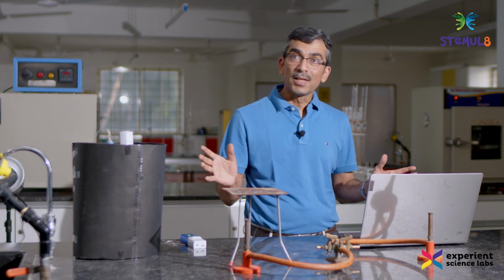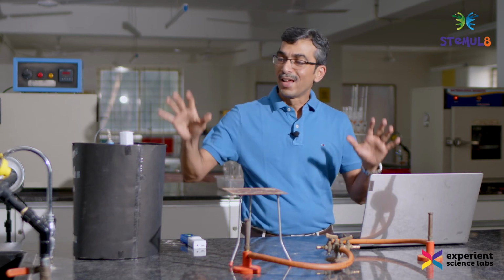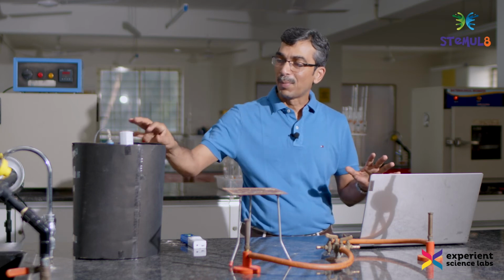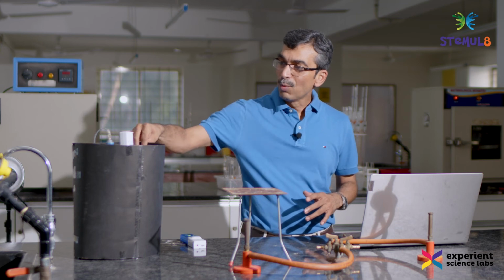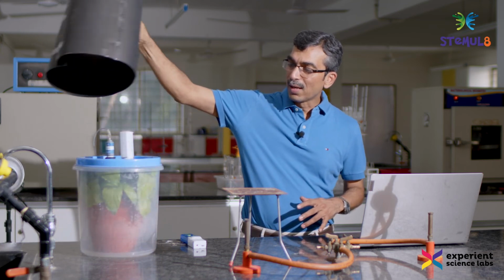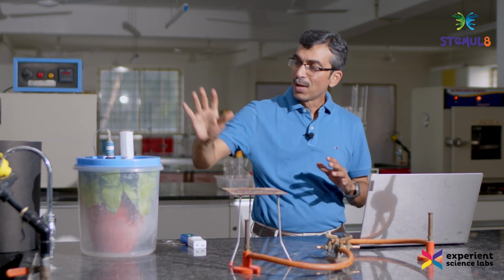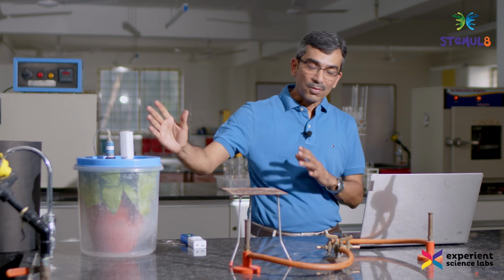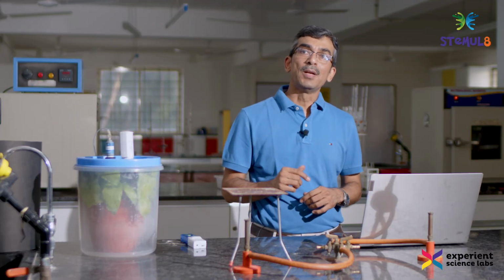This is as real as it gets. We have not changed any setup. We just switched off the lights. We added this black paper cylinder to cover the plant completely. If I remove it, you can see the plant being there, and nothing much has changed in terms of the setup. Sensors are there. We are wirelessly collecting the data, and we are still getting similar results. So do let me know what you think has happened here.